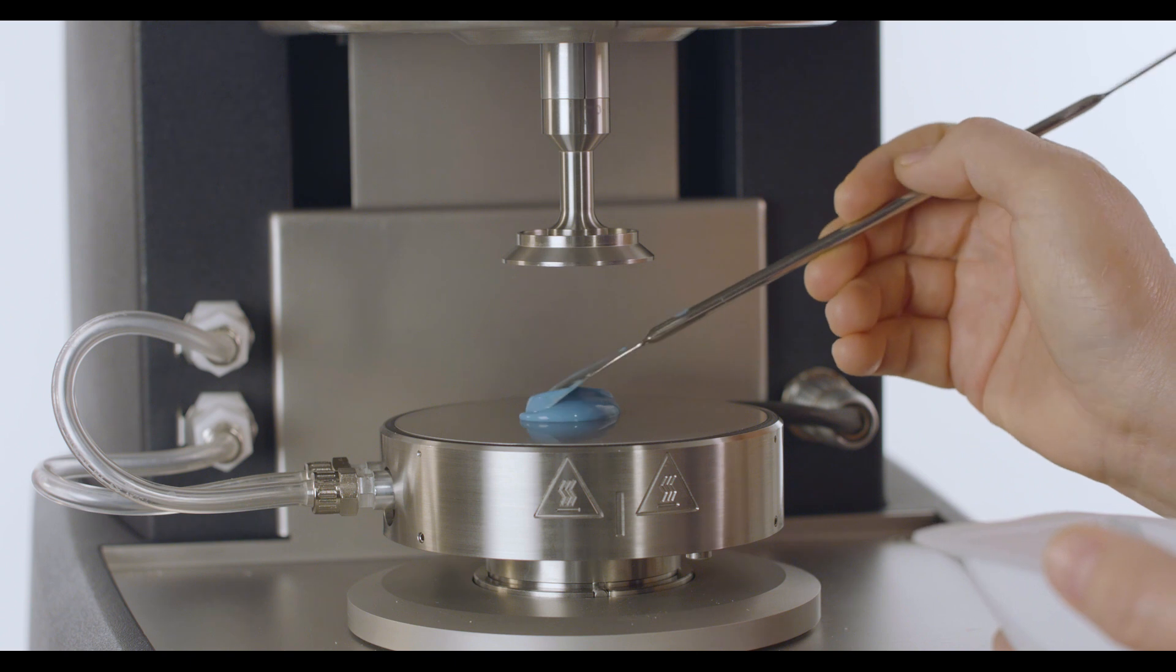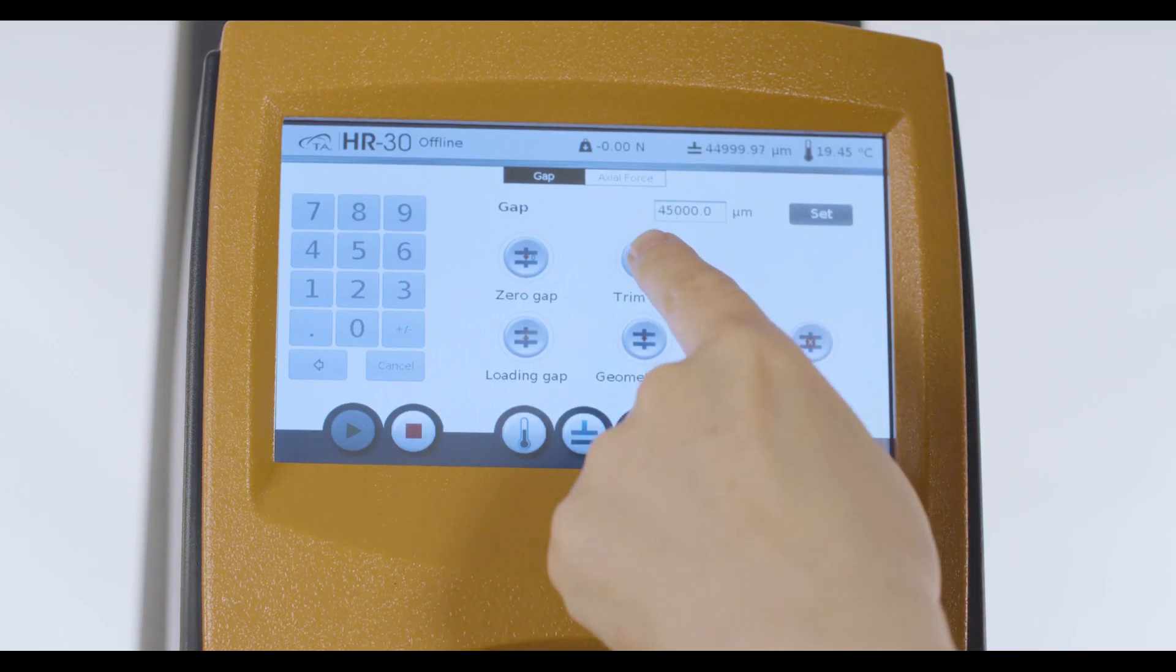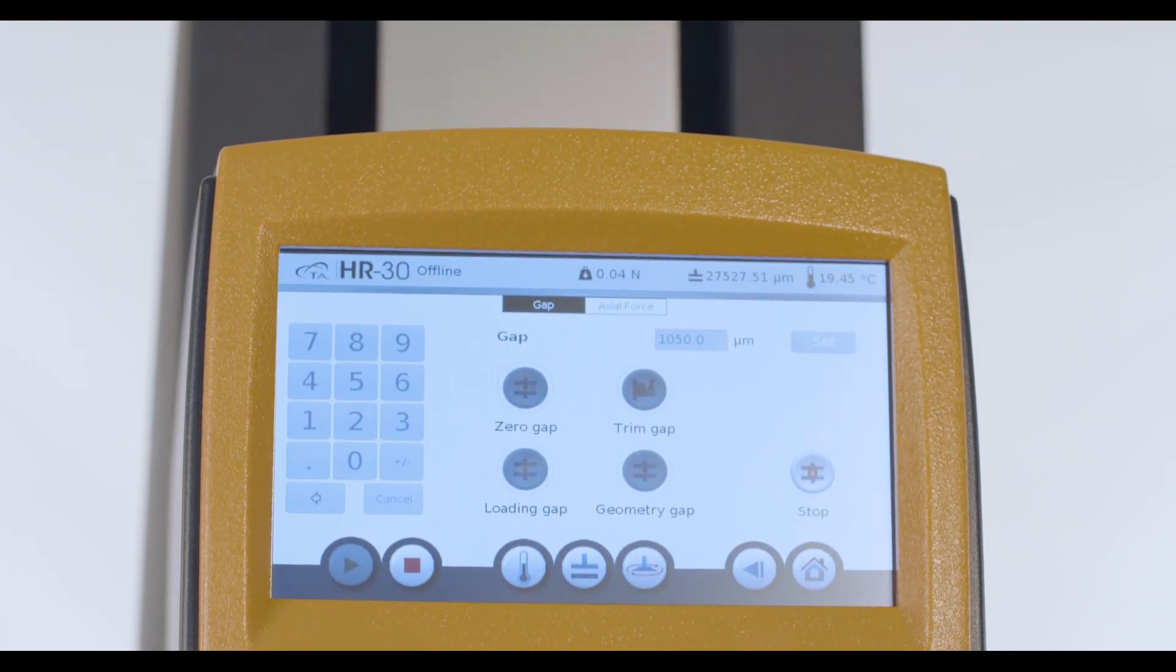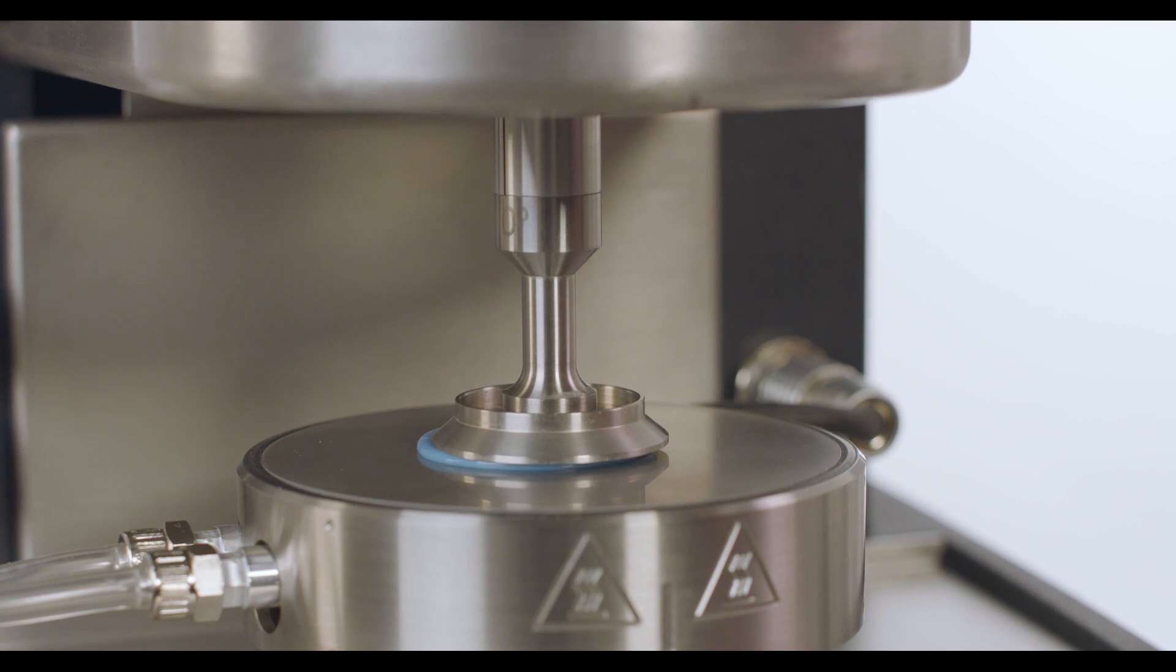Load your sample at the center of the bottom plate. Then, press this button to go to the trim gap. By default, the trim gap is set at a gap that is 5% above the final measurement gap.